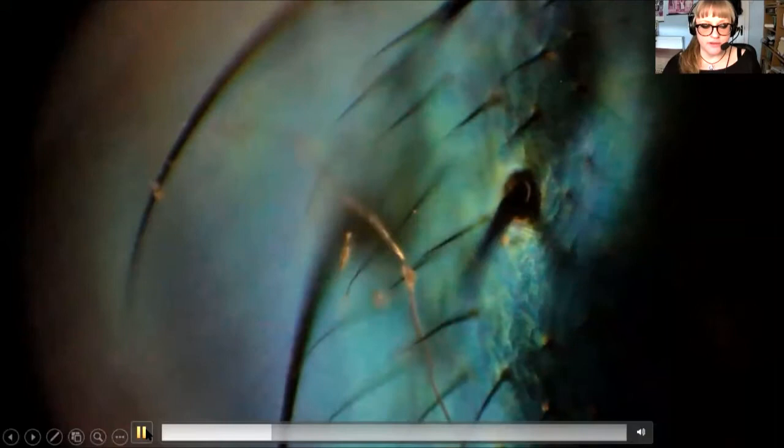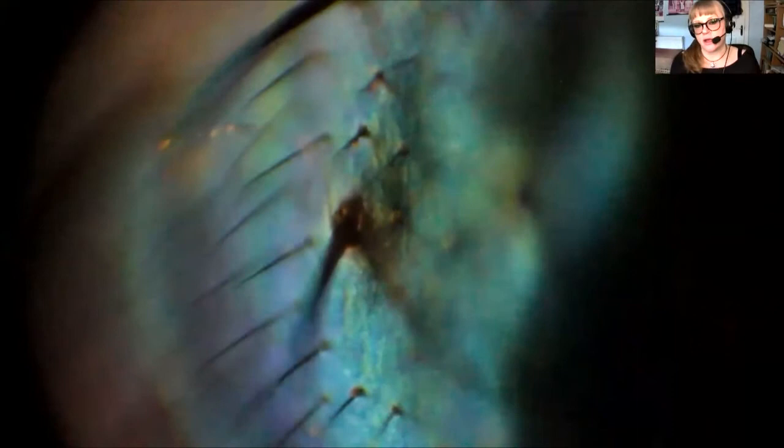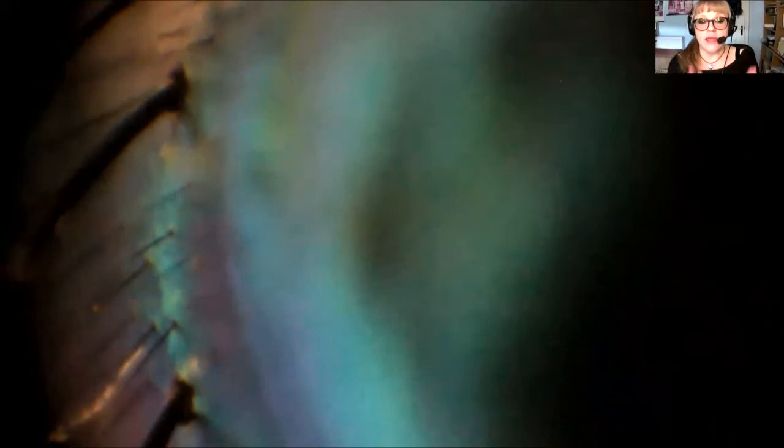I'll just show you the video that I took. This is just one example of many that I shot that day. This is a part of the body of a green bottle fly. As you move through the focal range, you can see that it kind of moves along that part of the body and you can see all the different hairs coming into focus. When you're at one end of it, obviously the other end is really badly focused and the other way around. By shooting the video and moving the focus like this, you end up with way more pictures. The way that you get those pictures is to extract the video frames using PIPP, and it's really easy to do, so I will show you how to do that now.